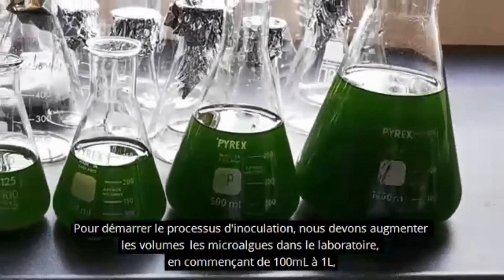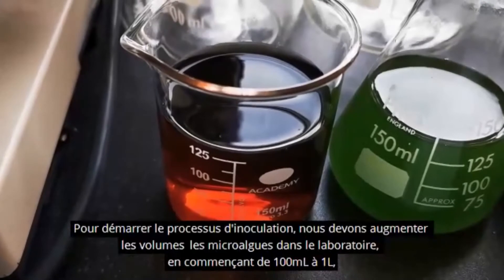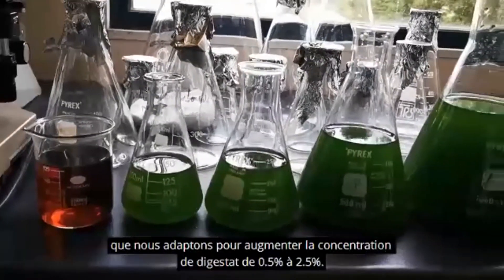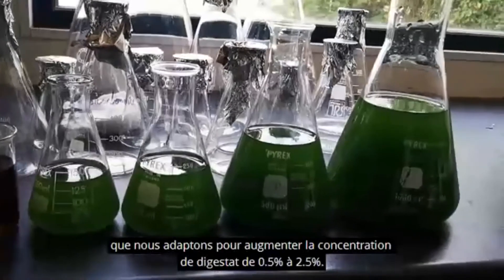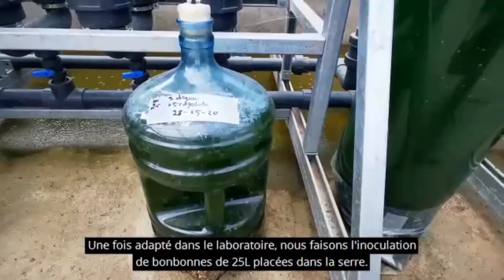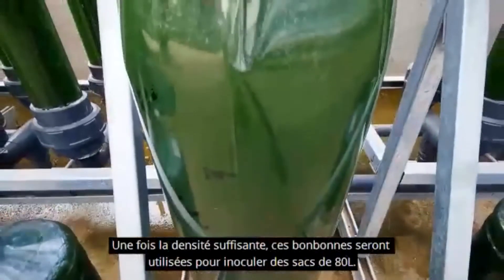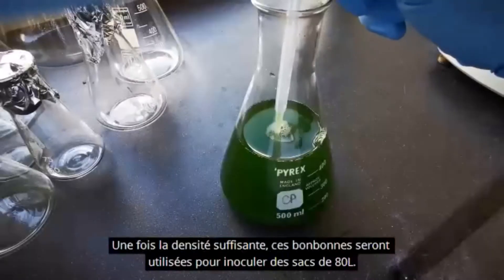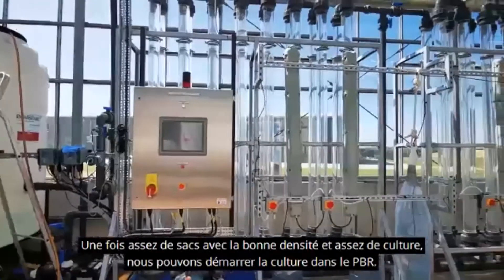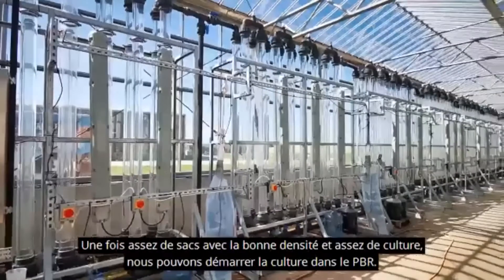To start with the inoculation process, we must first scale up the microalgae in the laboratory, starting from 100 milliliters to 1 litre, which we adapt to increasing concentration of digestate from 0.5% to 2.5%. Once adapted in the laboratory, we proceed to the inoculation of 25-litre carboys located in the greenhouse. These carboys will be used to inoculate 80-litre bags when the density is enough for scaling up. Finally, when we have enough bags with the right density and litres of culture, we can start with the culture growing in the PBR.